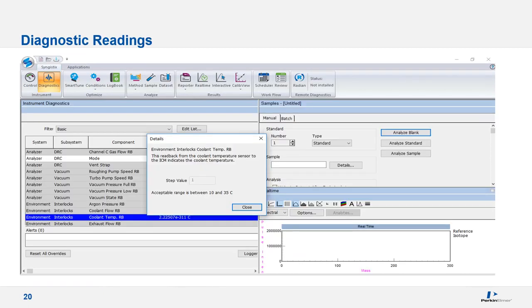Another great tip is the diagnostic readback within the Syngistix software. On this page, you can right-click on the temperature or voltage readback and a box will appear — similar to what I've shown in this slide. In this example, we are looking at the coolant temperature readback. This box will show the normal ranges for the parameter you are looking at; in this case, 10 to 35 degrees C is the acceptable range. When your lab is having issues, you can see through this diagnostic feature where the problem may stem, helping you and service develop a plan to address instrument or facility repairs.